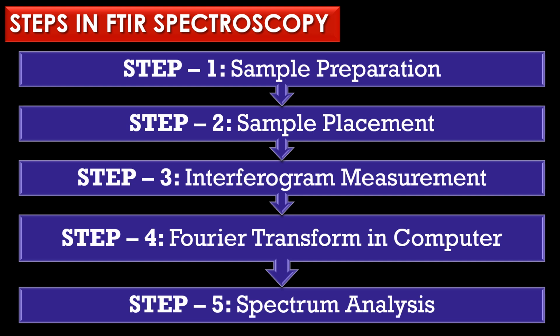Finally, the fifth step is spectrum analysis. The resulting IR spectrum is analyzed to identify absorption peaks corresponding to specific molecular vibrations, providing insight into the sample's chemical structure.